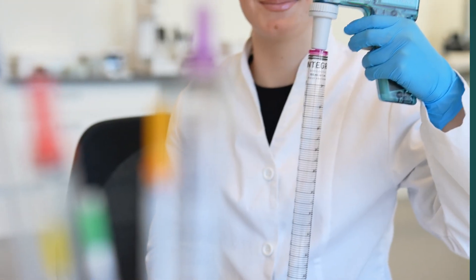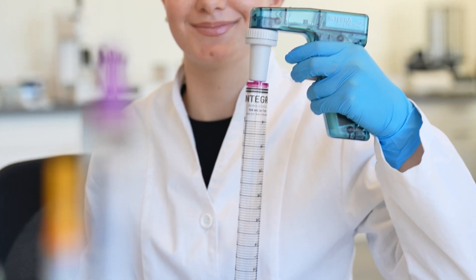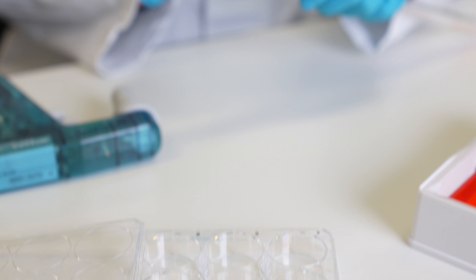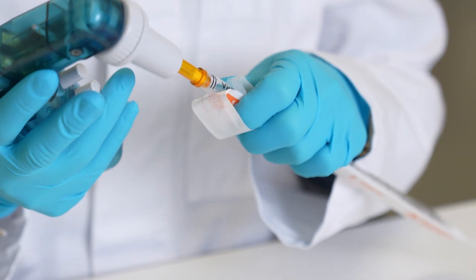Alternatively, the pipets can be used with our well-known PipetBoy Accu2, a combination that perfectly fulfills all your basic serological pipetting needs. For more information, visit our website.